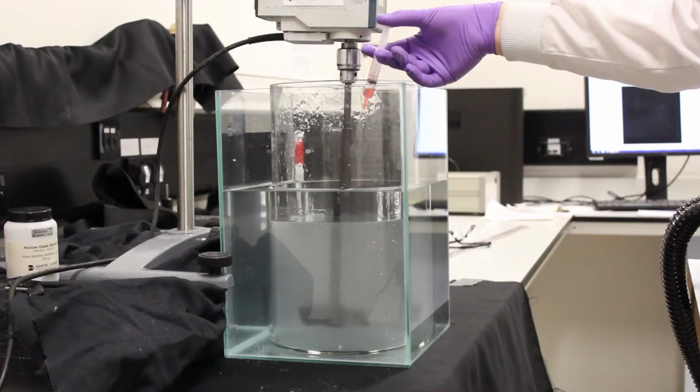So from there, we then inject this into the vessel, in this case agitated by an impeller, and by looking at the local brightness of the dye and on the process data at the local grayscale values, we can work out local dye concentrations, and we can use this as a substitute for knowing, say, a reactant concentration if a reaction is important, or when trying to mix two fluids we need to know local concentrations to ensure homogeneity.